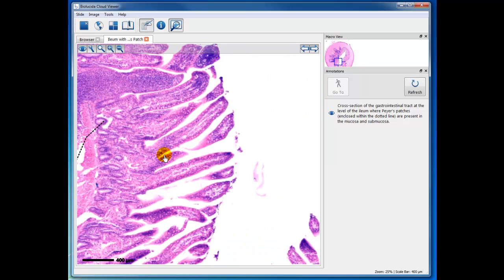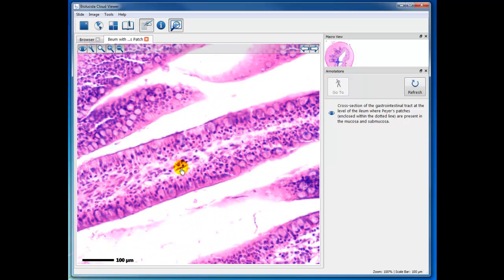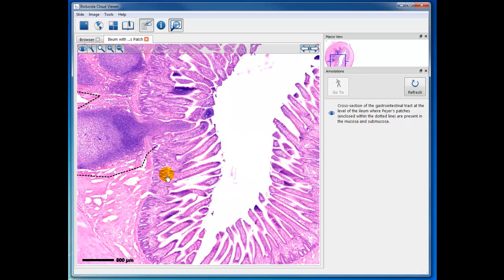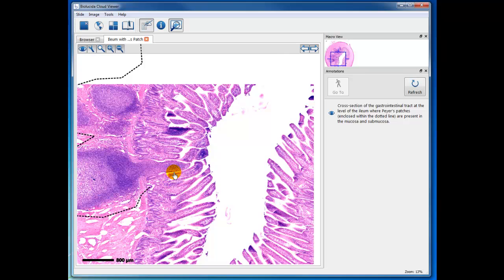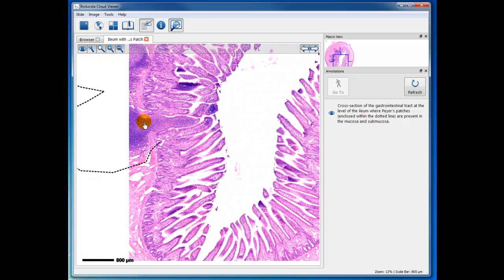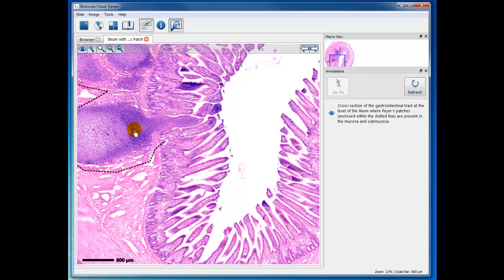And you can see the ileum has very tall villi, and you can see the goblet cells, and you can see the lamina propria, and this thin dark border represents the striated border once again, and the intestinal glands, muscularis mucosa, etc. Now, there are special cells called M cells that cover this, that facilitate interchange between antigen in the lumen and the T and B cells, and mostly B cells in these follicles.